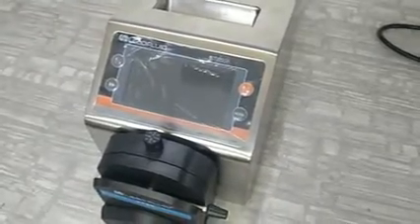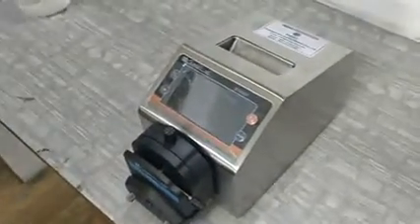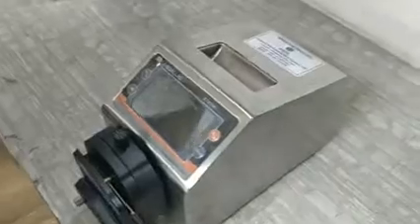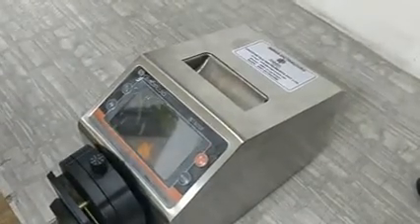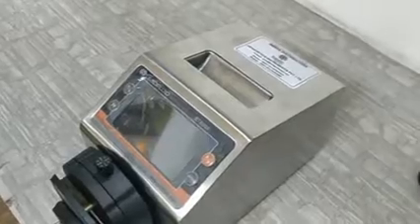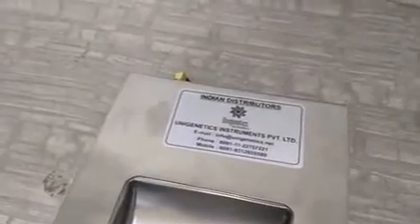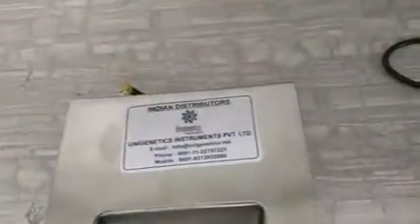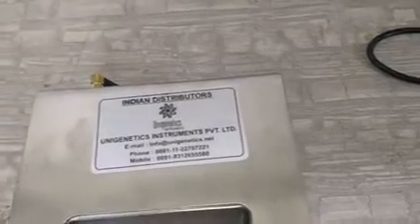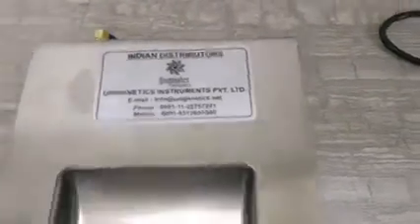This particular model is BT-600F, which is a top-of-the-line peristaltic pump. This is Version 3, meaning the firmware is updated and this is the latest one. This pump is at par with the Masterflex represented by Cole-Parmer, and price-wise it is almost half or even lower. Though this is a simple plug-and-play machine, we are giving a demo to make it easier for customers to begin.